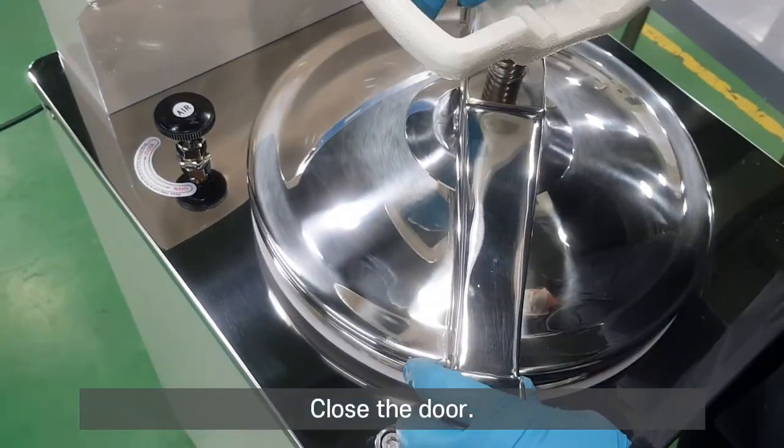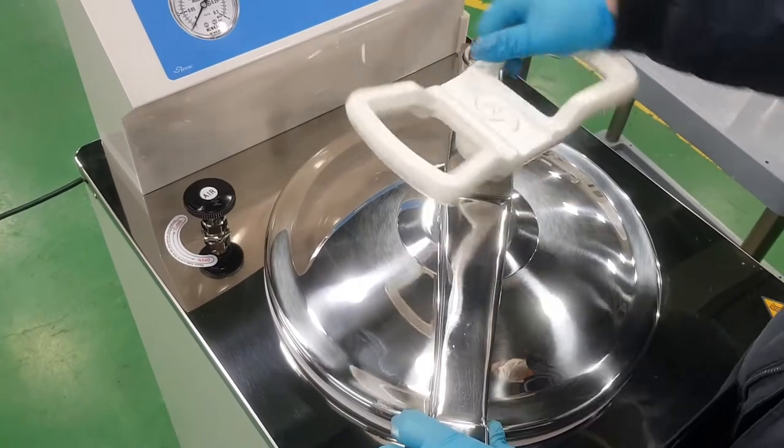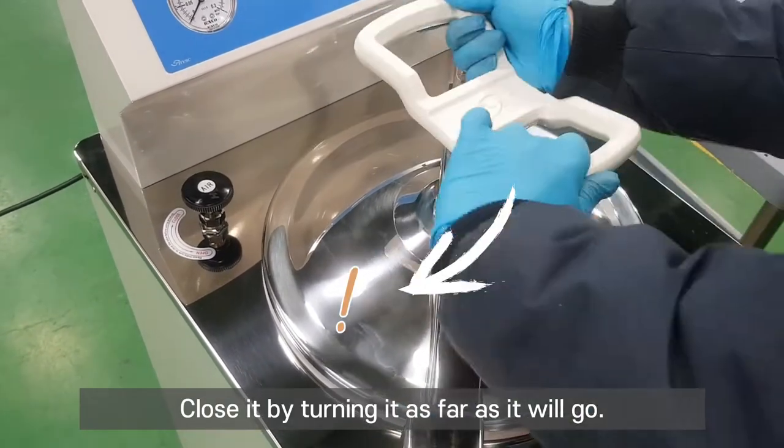Close the door. Close it by turning it as far as it will go.